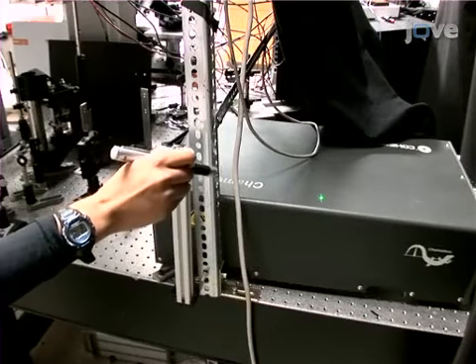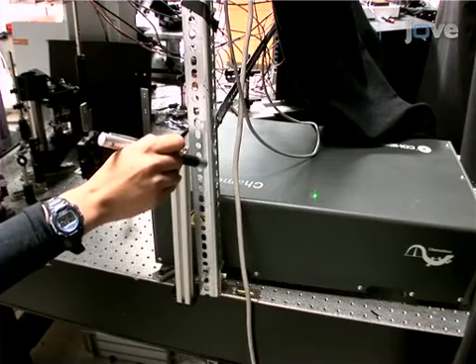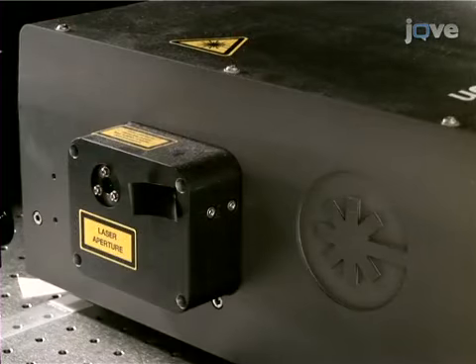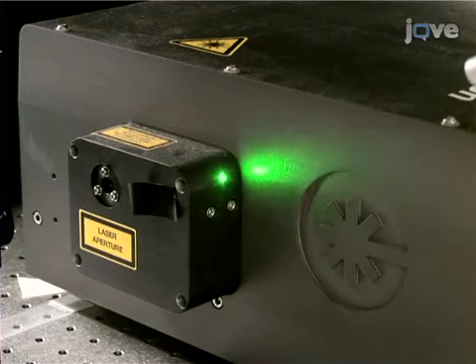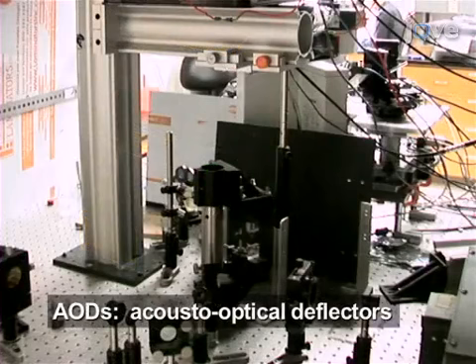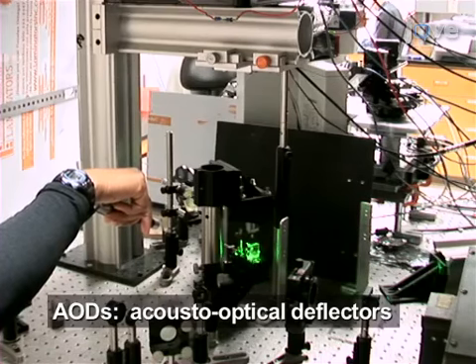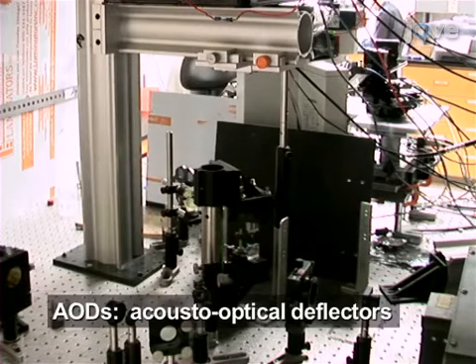For two-photon excitation, an infrared pulsed laser system with femtosecond pulses is used. A high laser output power is required to offset the large losses introduced by the optical components of the system. A pre-chirper system consisting of two prisms imparts a negative group velocity dispersion onto the laser pulses prior to the acousto-optical deflectors to compensate for the temporal dispersion introduced by the AODs.